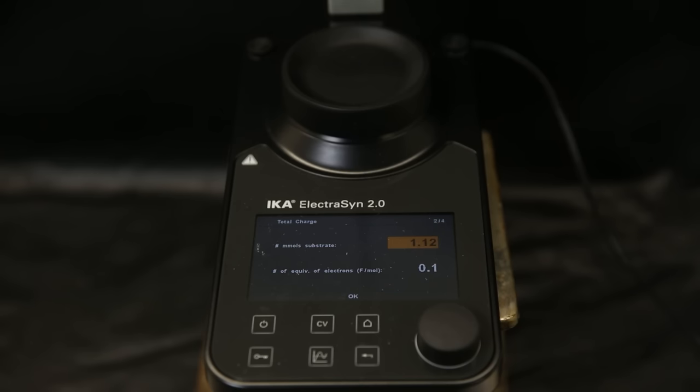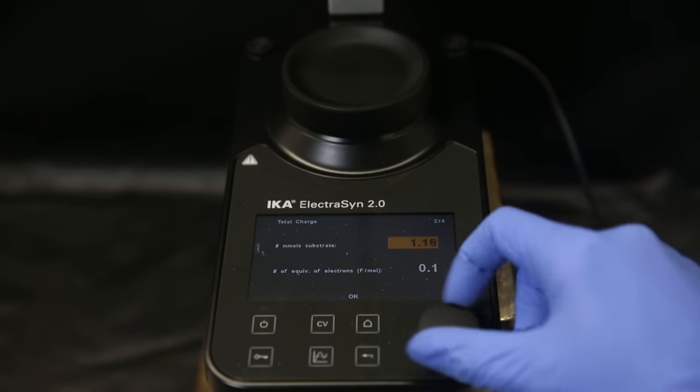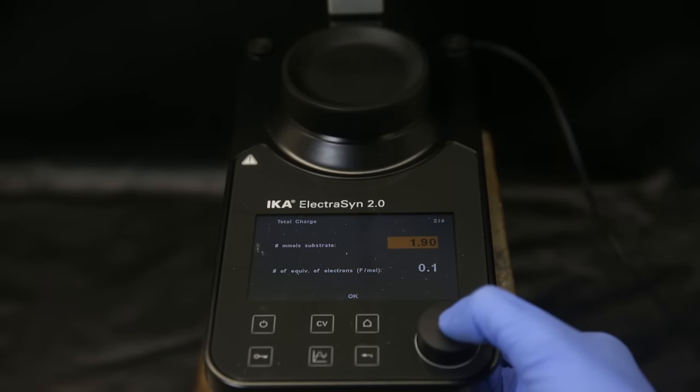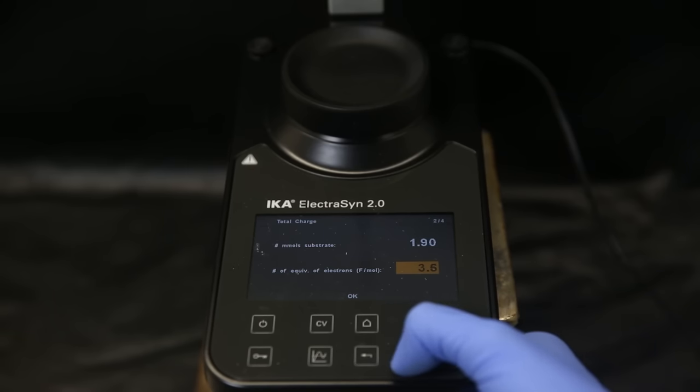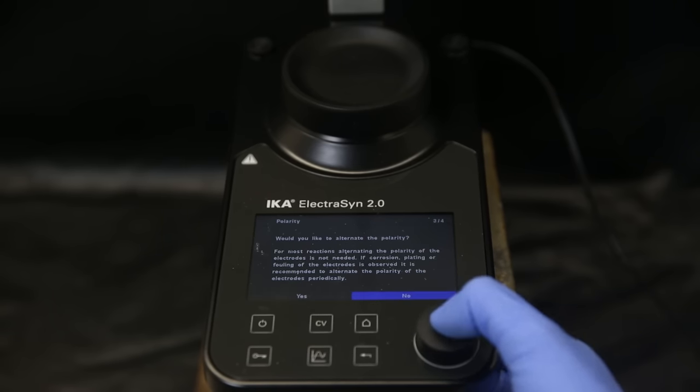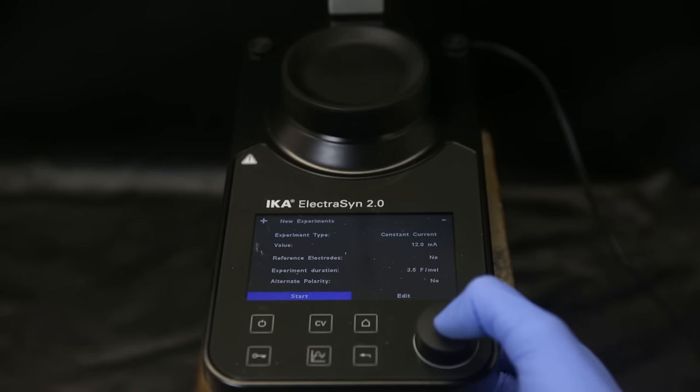First, I select the amount of millimoles of substrate that I am using, which is 1.9. I then use the same value as in the literature for the electrical charge, which is 3.5 Faraday per mole. This means that the device will supply 3.5 mole electrons for each mole of substrate. I then select no for alternating polarity since it is not necessary, and I don't save the experiment.